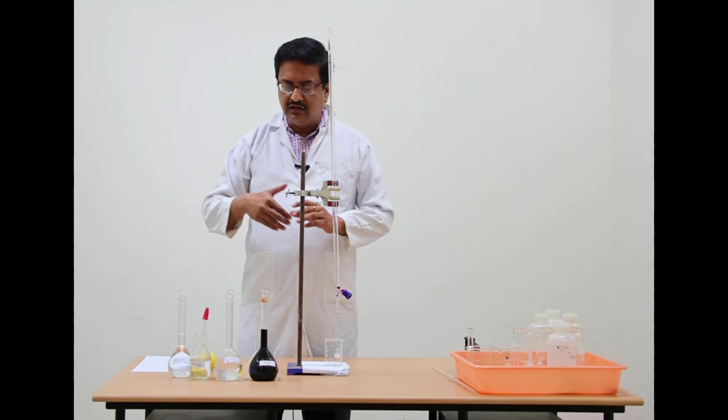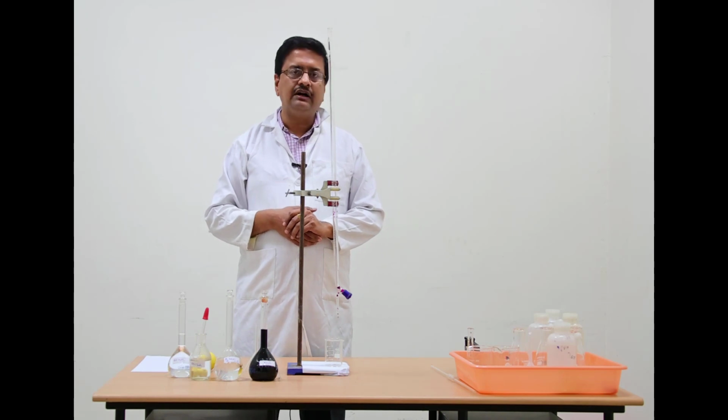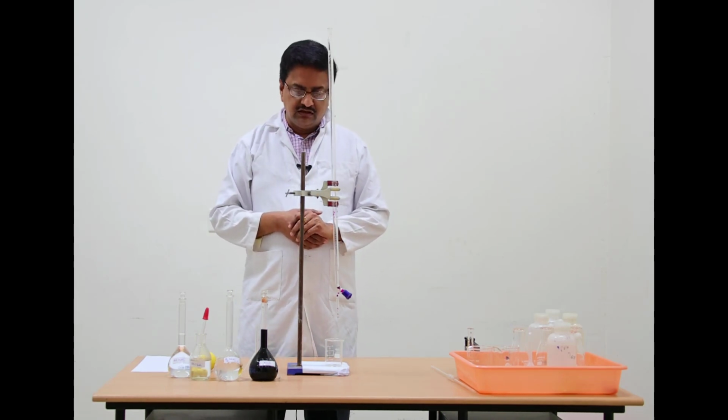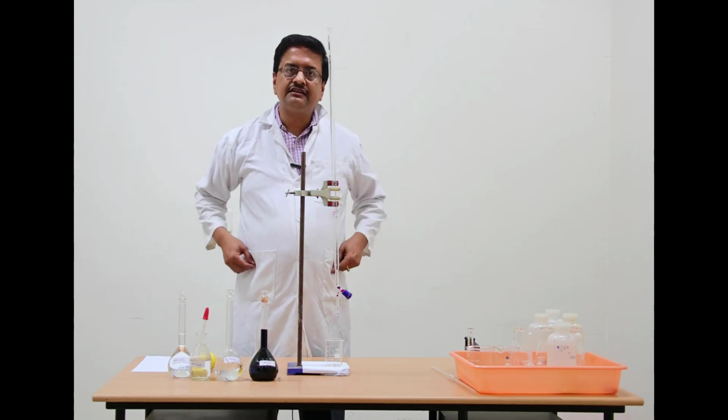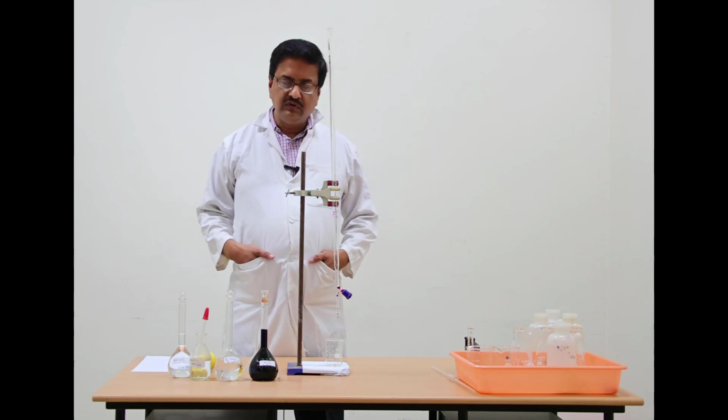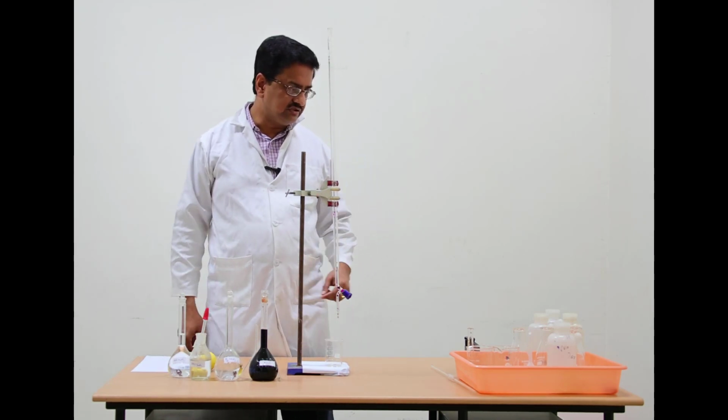with sulfuric acid to about 70 to 80 degrees centigrade to start the reaction. This reaction, as I have already discussed, is a very slow reaction at room temperature, and that is why we need to heat this solution.